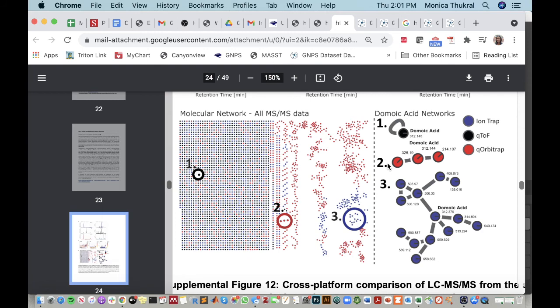In summary, the GNPS dashboard directly benefited the investigation into Pseudonitzschia australis metabolomics by allowing for rapid and efficient comparison between 3 instruments with different data analysis platforms. The GNPS dashboard will serve as a valuable data integration tool for analysis going forward.